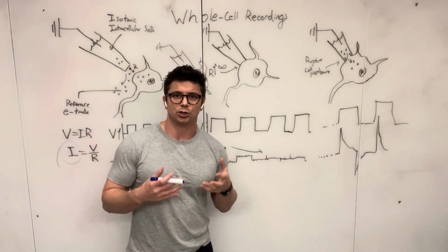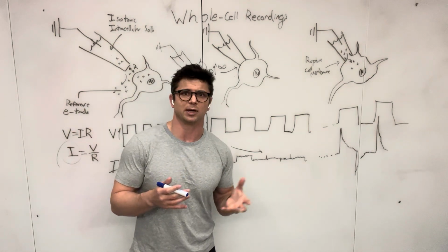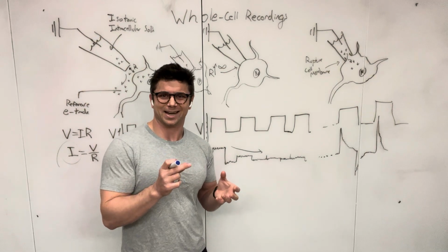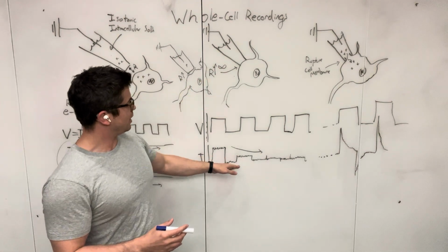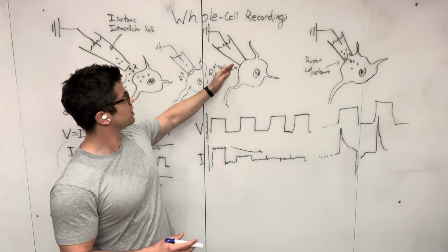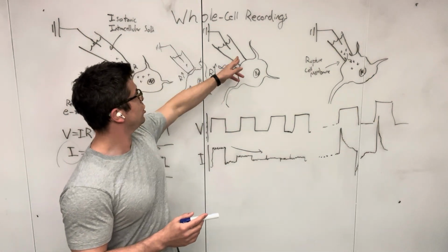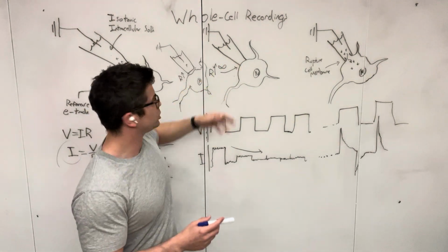And that's one way that you can tell you're really close to a neuron, even if you're not able to visualize it with a microscope, which sometimes you can. So you get your recording pipette really close using a micromanipulator, so you can move microns at a time closer to these neurons. And as the current generated from each voltage step gets really small, you then apply a little bit of suction and your glass pipette seals to the actual cell membrane, so that there's essentially no flow of ions from your intracellular recording pipette out to your reference electrode.